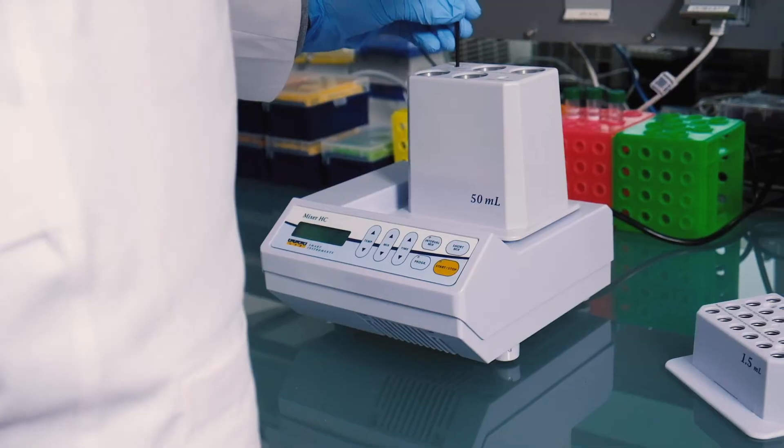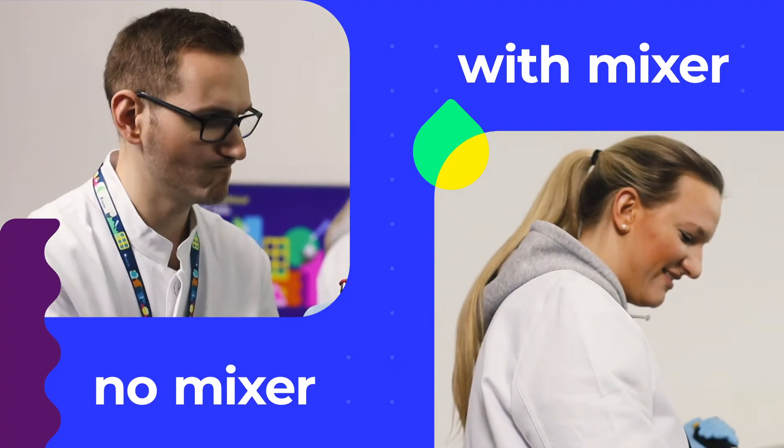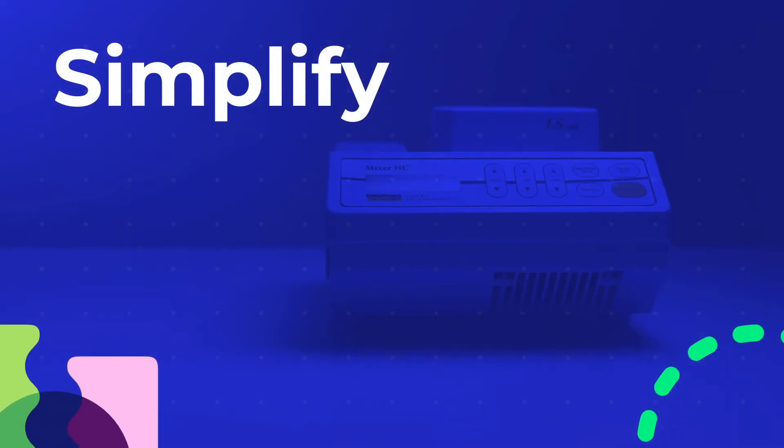An all-in-one solution that will save you time and effort for a stress-free day in the lab. Simplify workflows with your Mixer HC.